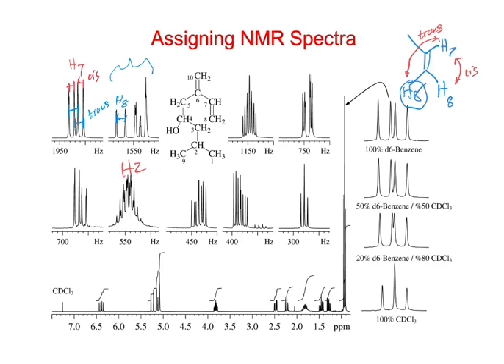And if we wanted to find the cis, we could do the same thing, but we mark the size of the cis coupling. See, so it doesn't match that. Probably doesn't really match here. It's probably here and underneath that big one there or something. So to me, it looks like the red is something like here to something under there. Right, so it's going to be overlapped.